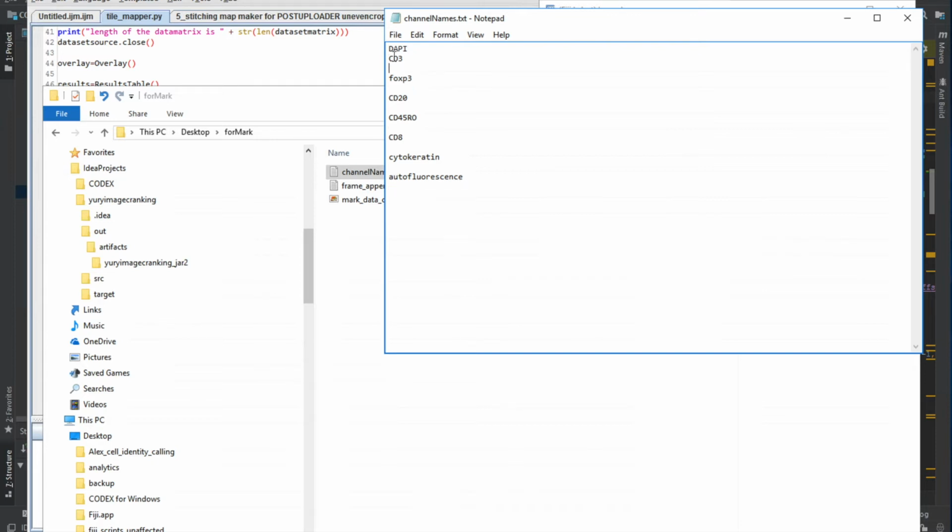Well, it doesn't matter. You'll figure it out, but I think your CD45, maybe it's either you have all the B cells, maybe what I thought is your CD45 is your CD20. Whatever, it doesn't matter. Just for the sake of example, let's keep it as a channel file. Maybe I was wrong, but that's how CD45 should look like. That's what we'll use as a membrane channel in this particular case.